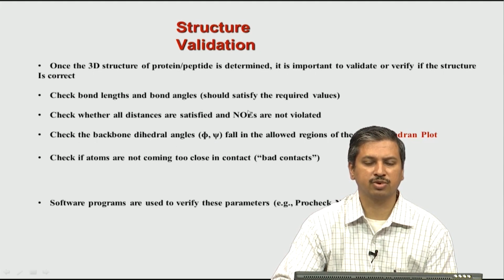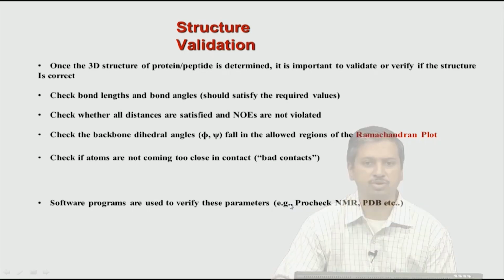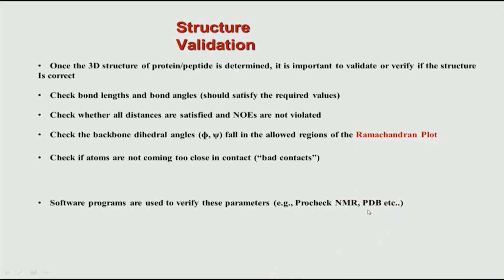All these checks are done in an automated way by software programs nowadays, and typically the names of the software programs are given here. There is a very famous program called ProCheck NMR. In fact, when we deposit our structures in the PDB, the data bank, PDB also has an inbuilt validation software, which checks before you finally deposit the structure to the data bank. So this is the structure validation we have looked at very briefly. There are many more parameters to be checked, but these are the major ones.